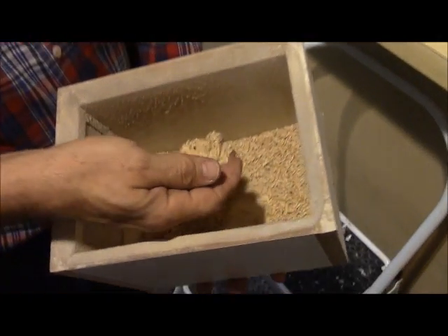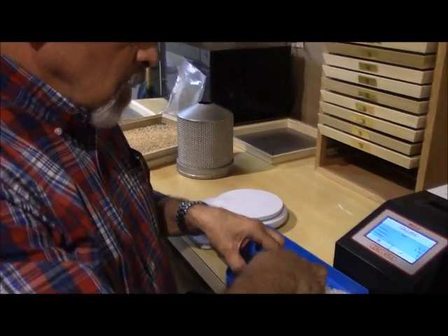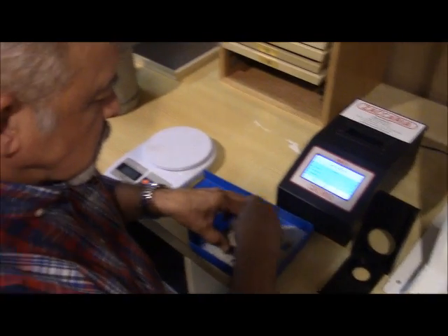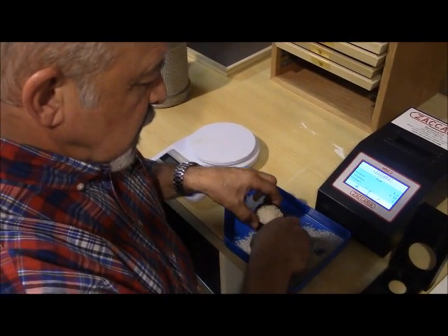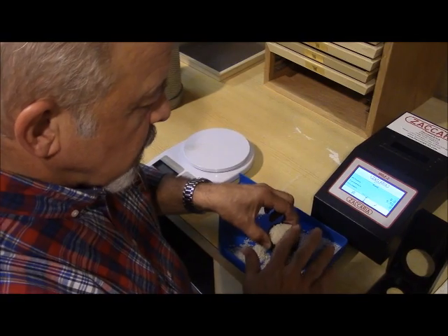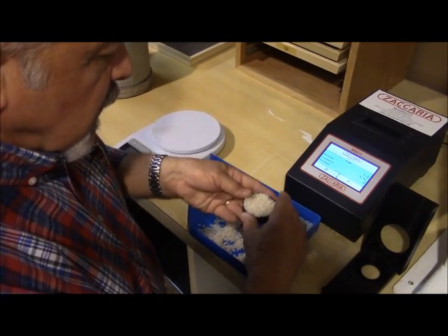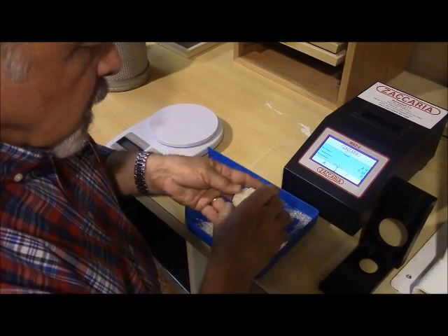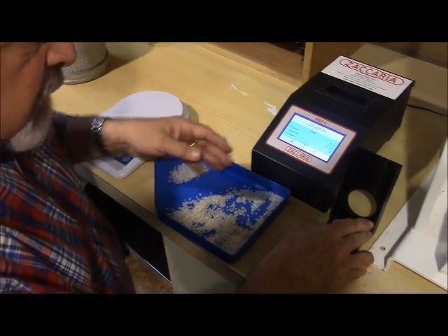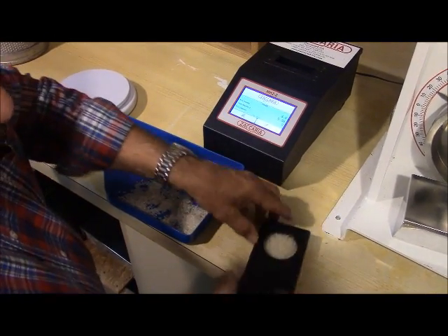This is the composition of the husking bran material. Now we're going to perform the whiteness test where we will insert this sample into the machine and it will give us three values. It will indicate the degree of whiteness or bran removed, as well as a value for transparency — how translucent the kernel is — and polish, and how effectively we have polished and removed the scratch marks from the whitening process.